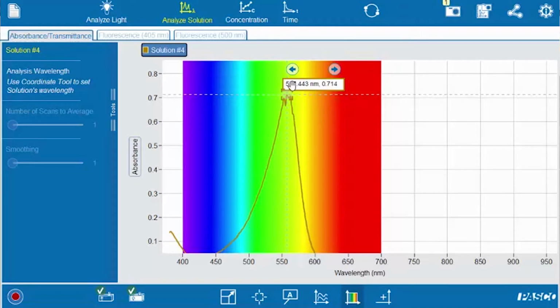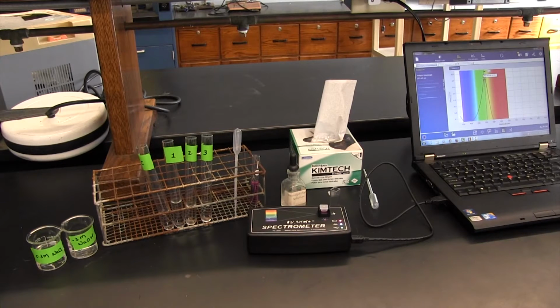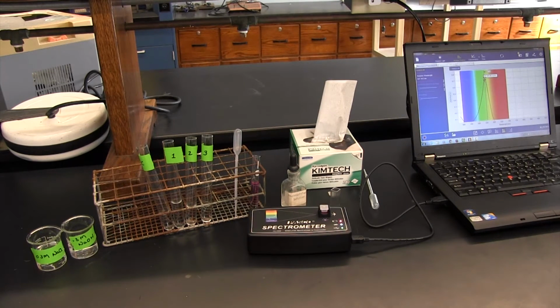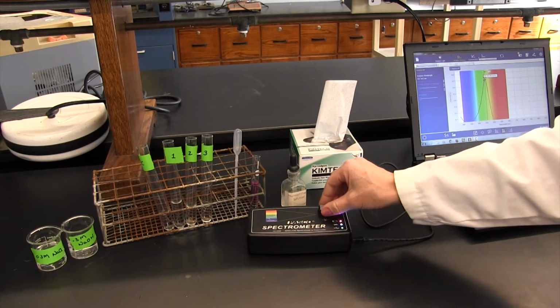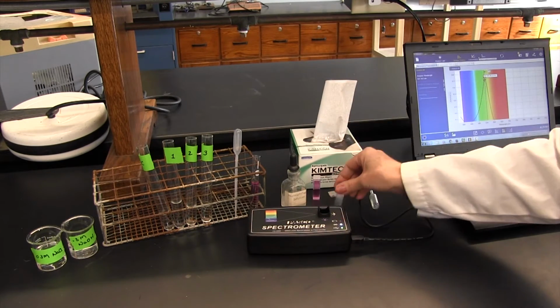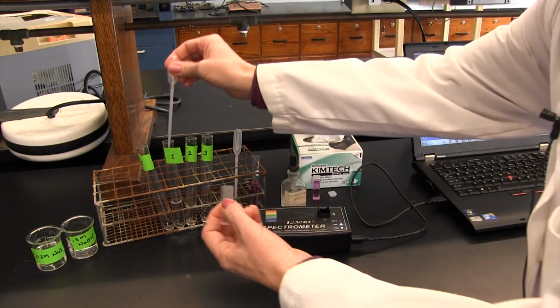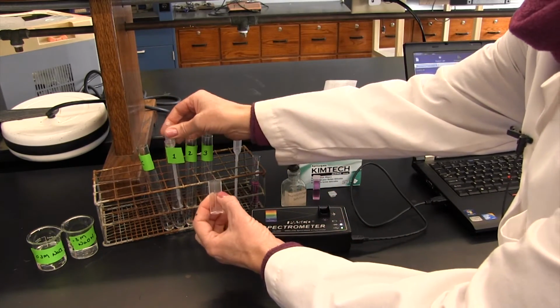So to tell the spectrometer to do that, all we have to do is hit this check button. So now we're ready to analyze our reaction solution as a function of time. So we're going to remove the calibration solution. To our next cuvette, we will add solution number 1.